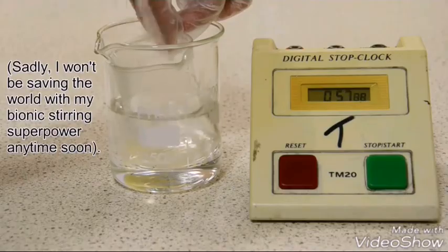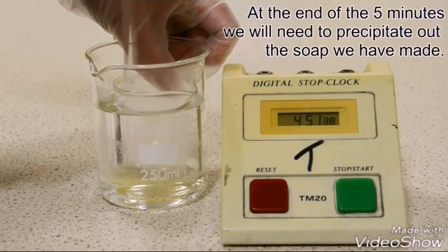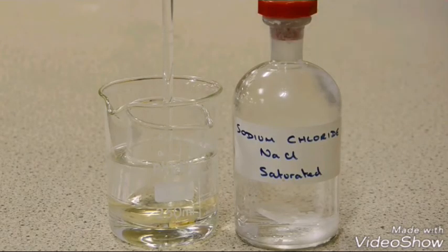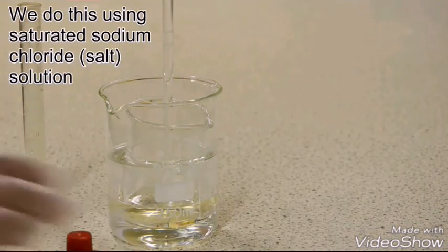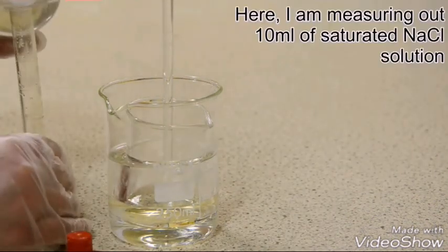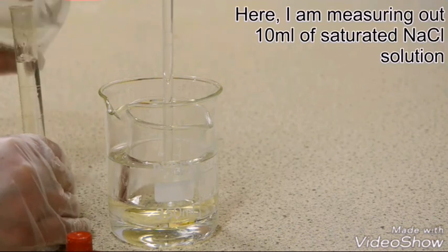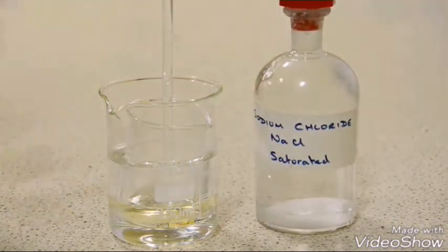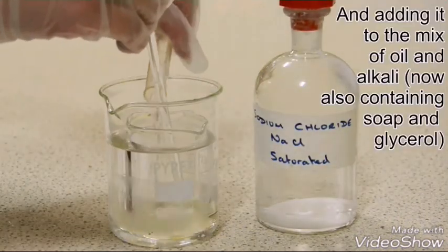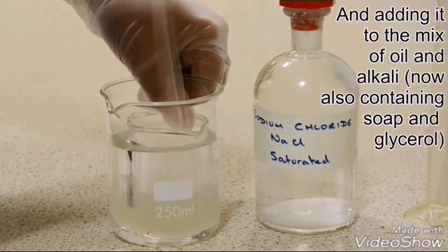So once we've stirred the mixture inside the beaker of hot water for 5 minutes, we're going to need to precipitate out the soap, because at the moment it's just a suspension inside the mixture. To do this, we're going to need sodium chloride or common salt. I've got a saturated solution of sodium chloride here, and I'm going to measure out 10 centimeters cubed, 10 milliliters of it, and then I'm going to add it to our soap suspension in the 100 milliliter beaker, and again I'm going to stir.